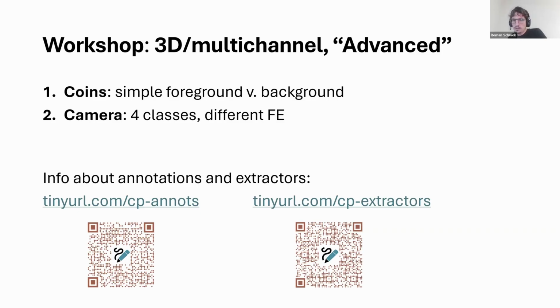So I've got a question from Yarif. What is the feature extraction method? Boosting, which, sorry, I think I don't really understand what you're asking. The feature extraction is always done with a pre-trained AI model.